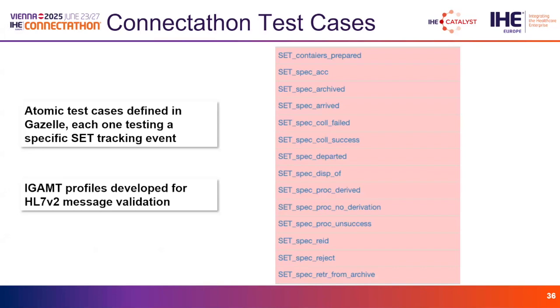Maybe a specimen event informer that comes to the Connectathon could join with some other Connectathon actor related to some other profile and collect from it some tracking information, and then send it to an event tracker that is also interested in joining the Connectathon. Maybe we could also have some simulator that generates this tracking information, which is used by the specimen event informer to build the messages for the event tracker.